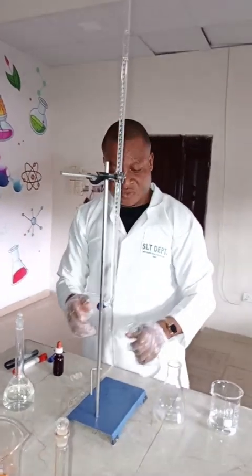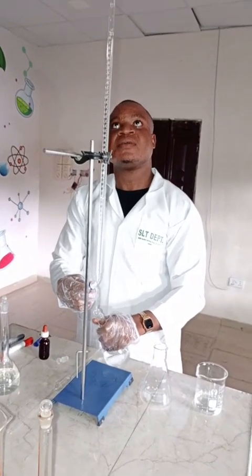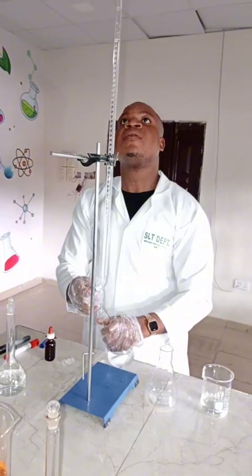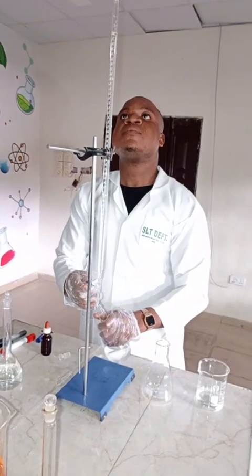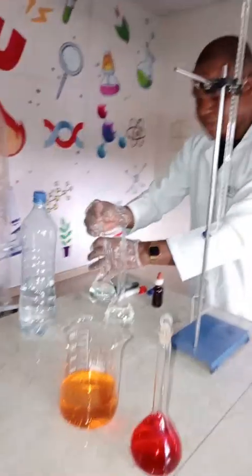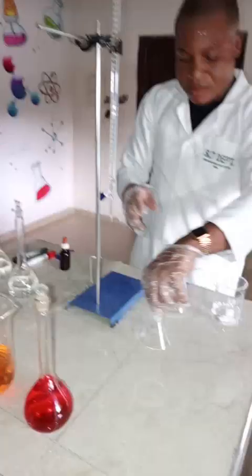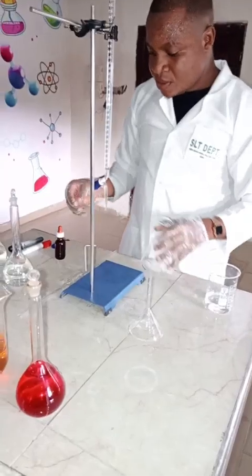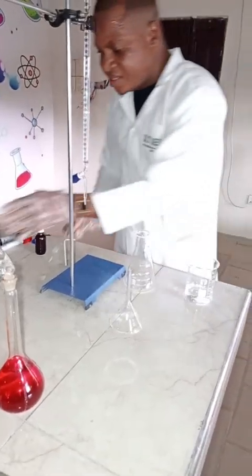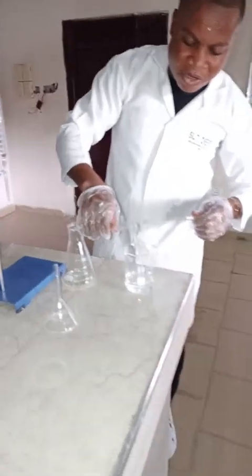Now that is above. I'm going to release it. Now this is the 0 mark. I'm going to take off my funnel. I'm going to pipette another 25 ml of the base. I've told you this is my base. For easy pipetting, I will still fill up this.